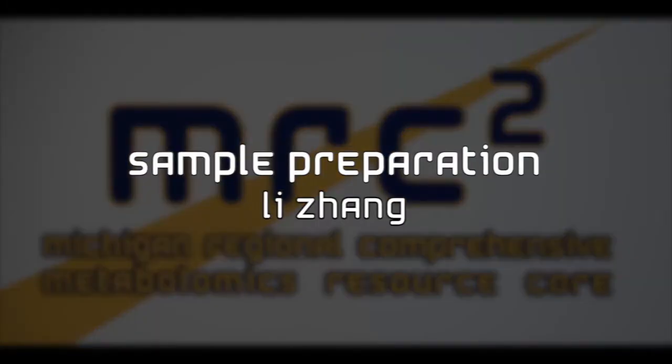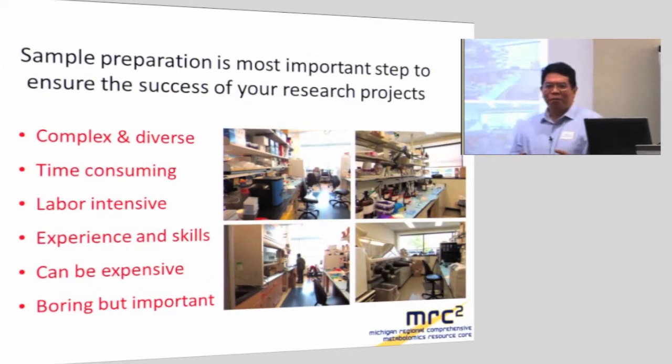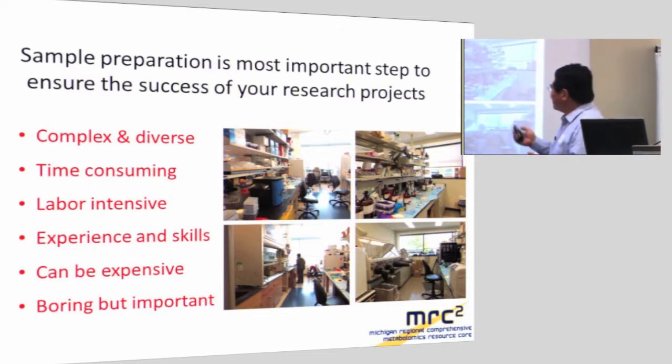Sample preparation is very complex. It's very diverse because you have different samples, your project is different, your budget, and your research goal. You can see this is our lab setup. There are different devices there. They have different setups for different sample preparation.